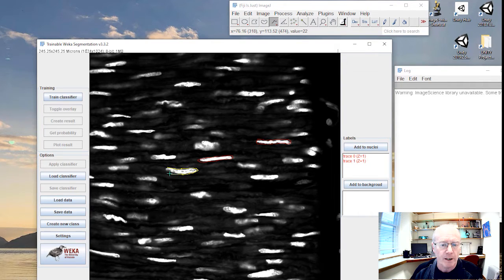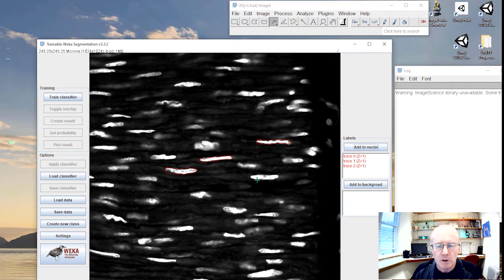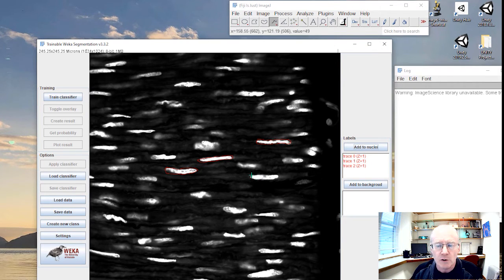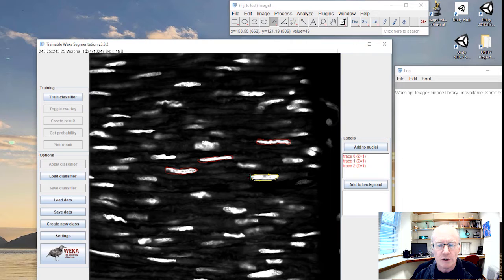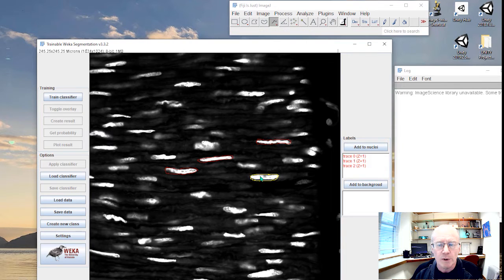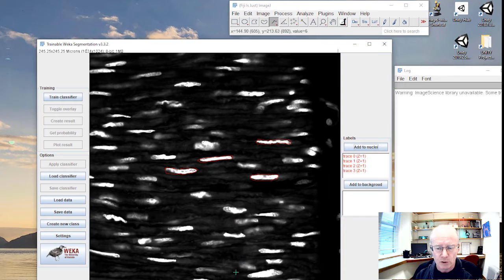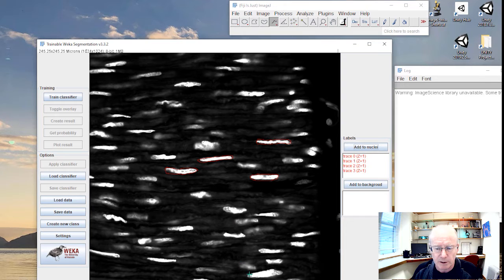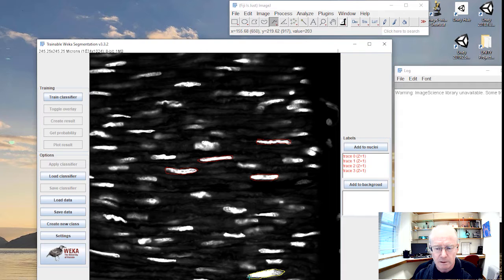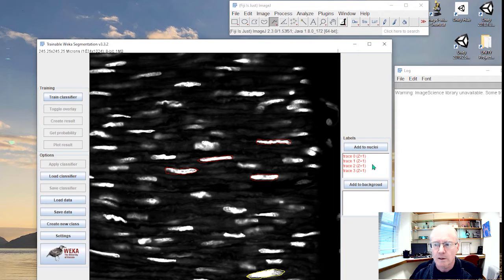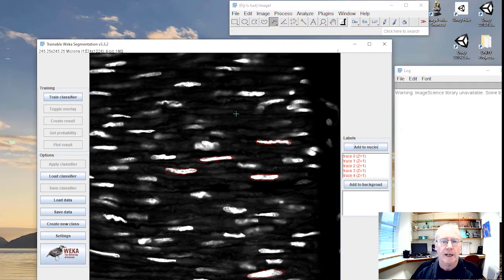And for the background, you maybe just want to have, so I didn't do that one very well. The better you can do this tracing, probably the better your trained algorithm will be. I've got four nuclei. Let me just do, let's do this big guy down here. So I've got four nuclei.